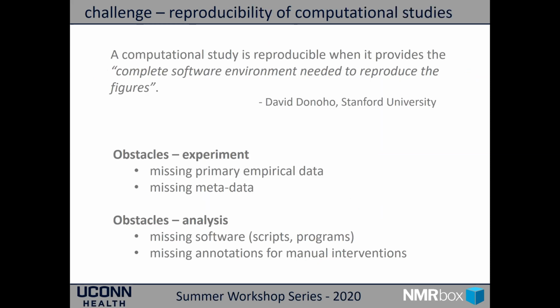And another big challenge, a problem more and more people are thinking about, is the reproducibility of computational studies. There's a great quote by David Donoho that says a computational study is reproducible only when it provides the complete software environment needed to reproduce the figures. And there are lots of obstacles to reproducibility.